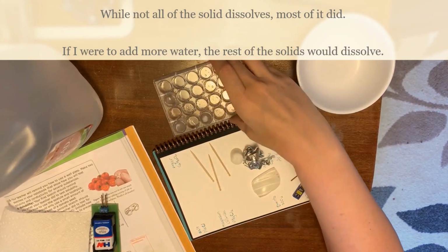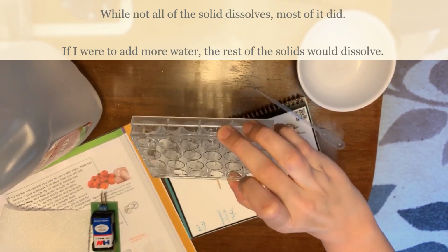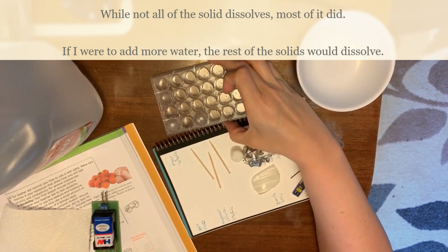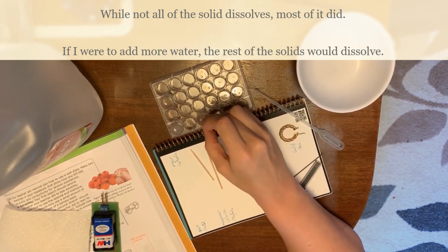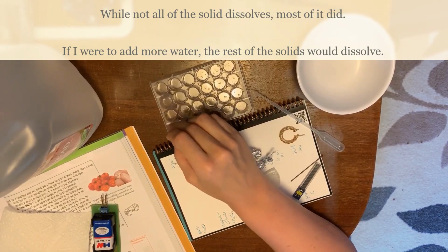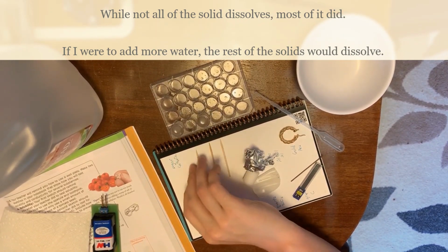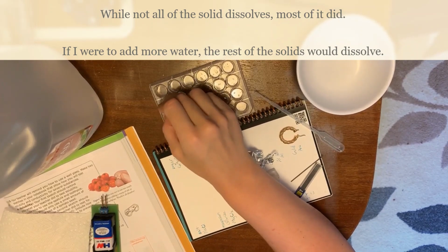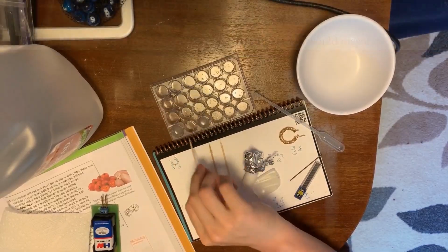Okay, so for each of those, you will see that the white crystals have, in some sense, disappeared, not completely. I can stir a little bit more. So these things are dissolving in the water. So you can figure out now which spot in the table each of these substances belong.